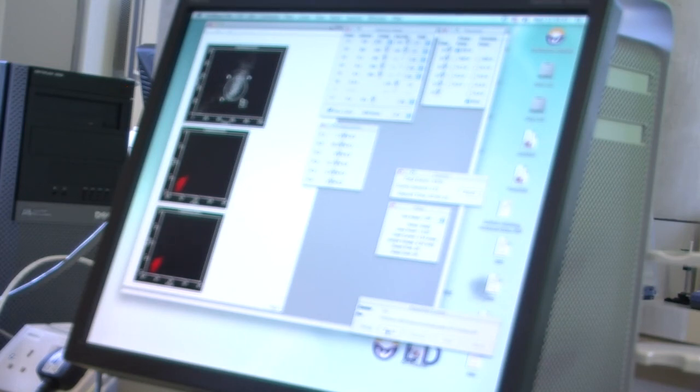Right, well, number 2 has got really good cell numbers. Because that's only taken about 40 seconds. Who was person number 2? Excellent. Have a metaphorical gold star. Good numbers going through. See, that was 43 seconds. Can we beat that, do we think? Anyone beat that? That's a bit of a challenge. We won't do absolute cell counts or anything like that, but so that's pretty good as well.